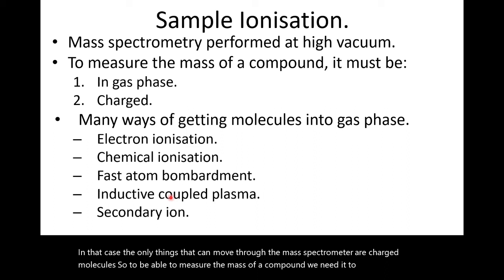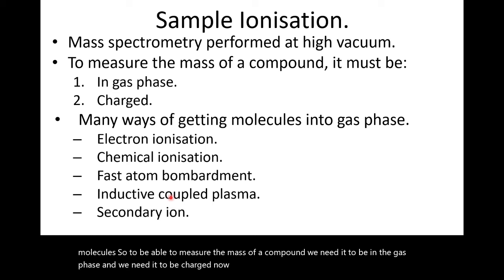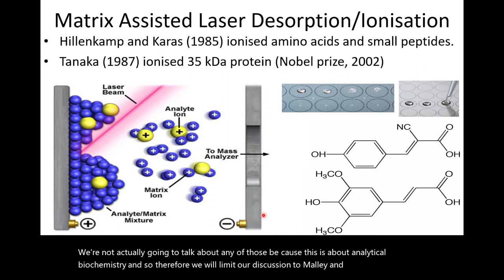Now, there are loads of ways of actually getting molecules into the gas phase inside a mass spectrometer: electron ionization, chemical ionization, fast atom bombardment, inductively coupled plasma, and secondary ion mass spectrometry. We're not actually going to talk about any of those because this is about analytical biochemistry, and so we will limit our discussion to MALDI and electrospray. So the first thing we're going to talk about is matrix-assisted laser desorption and ionization.